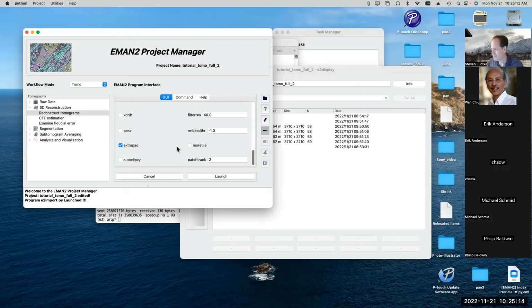That's not true. I would say it's not. In the cases where people have said, well, look at this one, and then look at what I got out of the EMAN reconstruction, I say, well, yeah, you're looking in a region where you don't have complete data, and you can't use the IMOD data, and you can't use the EMAN data. So why do you care what that region looks like?